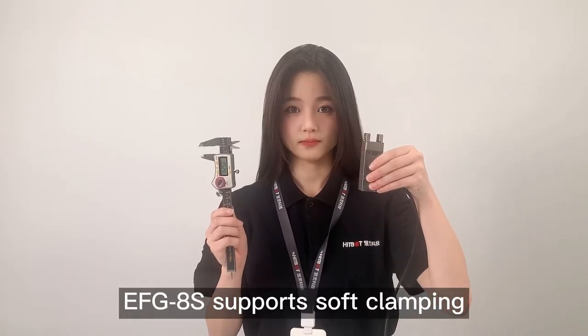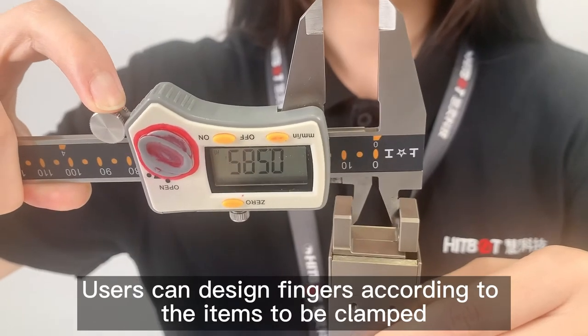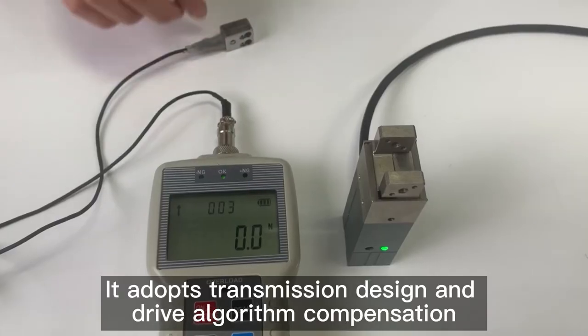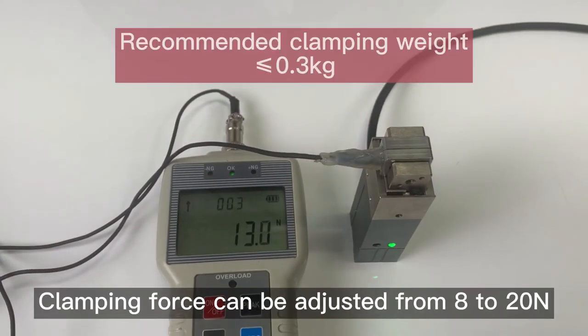EFG-8S supports soft clamping. Users can design fingers according to the items to be clamped. Total stroke is 8mm, finger inner distance 6.2mm. It adopts transmission design and drive algorithm compensation, with clamping force adjustable from 8 to 20N.